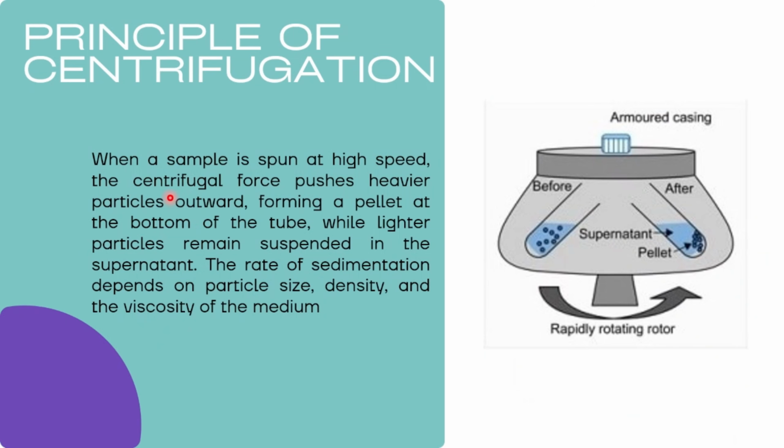Now, the principle of centrifugation is quite simple. When a sample is spun at high speed, the centrifugal force pushes the heavier particles outwards, forming pellets, while the lighter particles remain suspended as the supernatant.